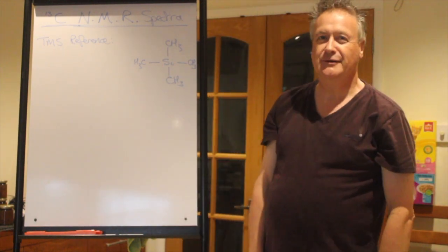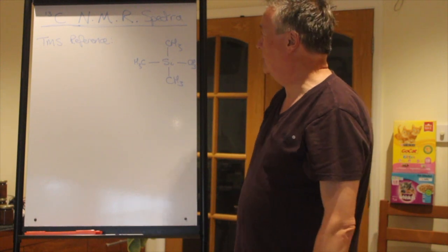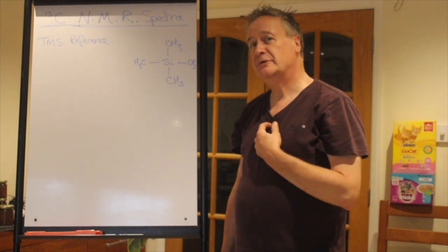Carbon-13 NMR. As a counterpoint to that, this is going to be get your brain in gear time. We need to be talking about interpreting the spectra.